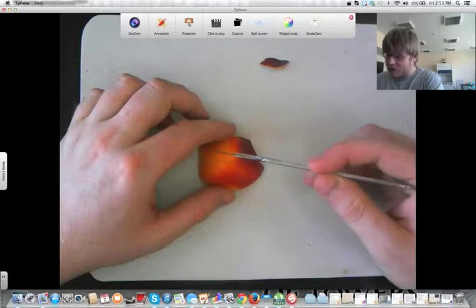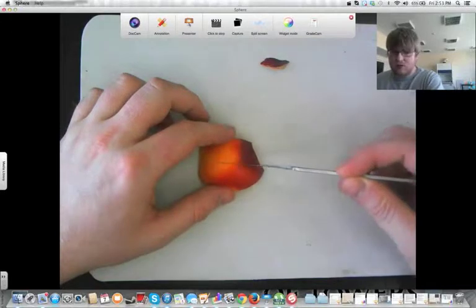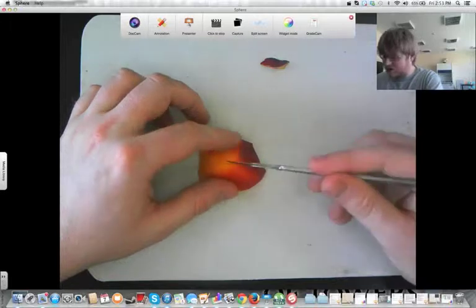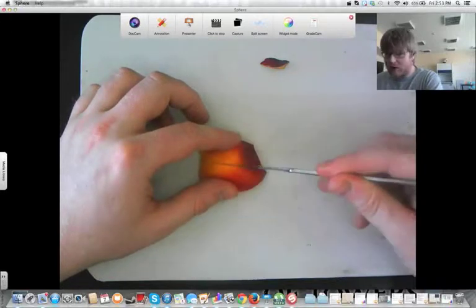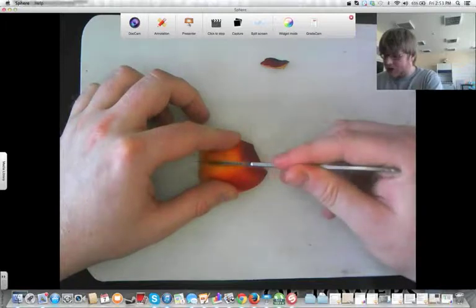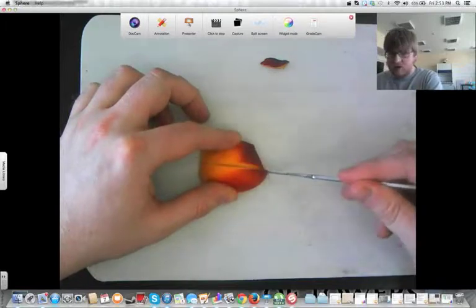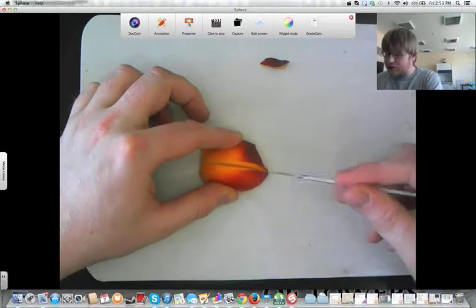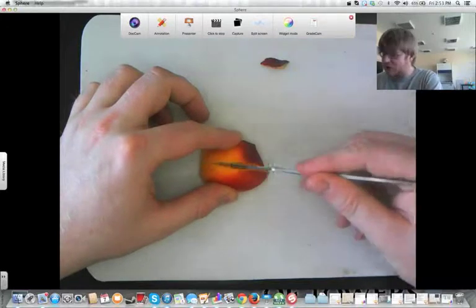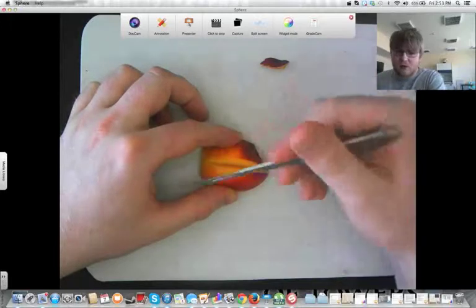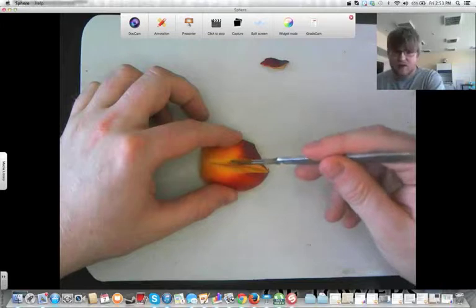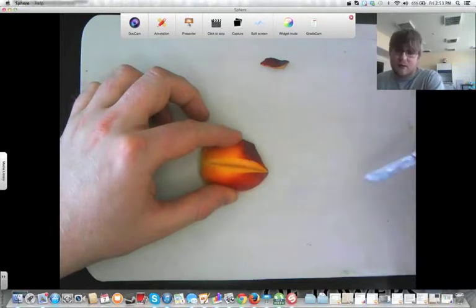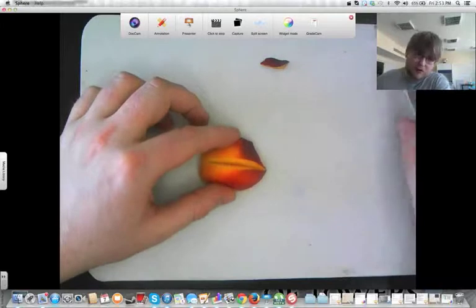You go slower than if you were cutting, but you don't have to do it really, really slowly. And what you'll see is the nectarine is slowly opening up and muscle or flesh will do the same thing. You're going to smoothly cut through. It's going to be slow and you're going to have a nice smooth cut. It's not going to be jagged like if you were trying to chop or stab your way through.